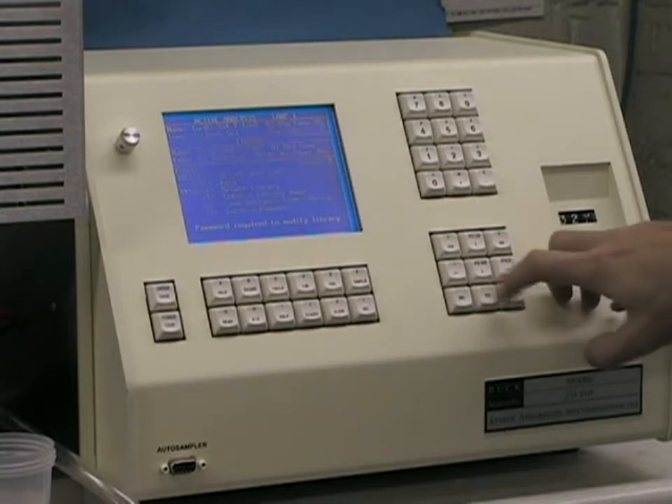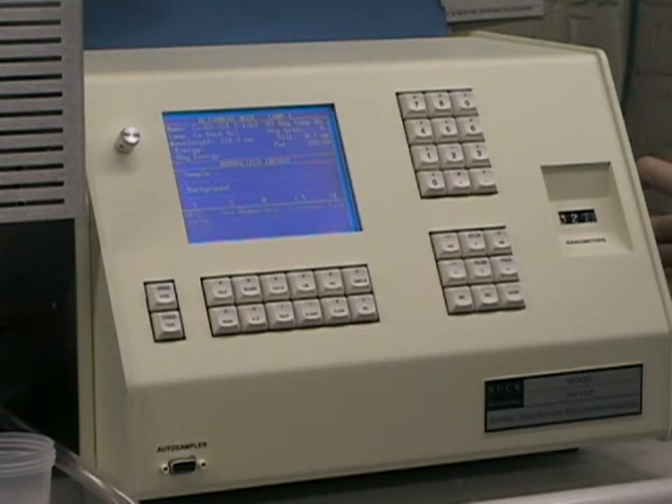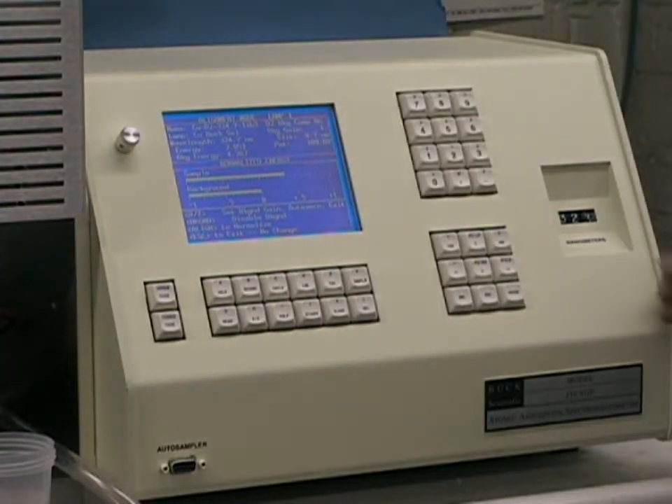Press the escape key, and then the align key, and using the wavelength scroll on the right side of the instrument, set the wavelength and slit as specified so that the bar graph, or the numerical value shown at the top of the screen, shows the highest value, which is minimal training. This procedure should take no more than 15 to 30 seconds. When you're done, press the auto zero key, and we'll be ready to begin our analysis.